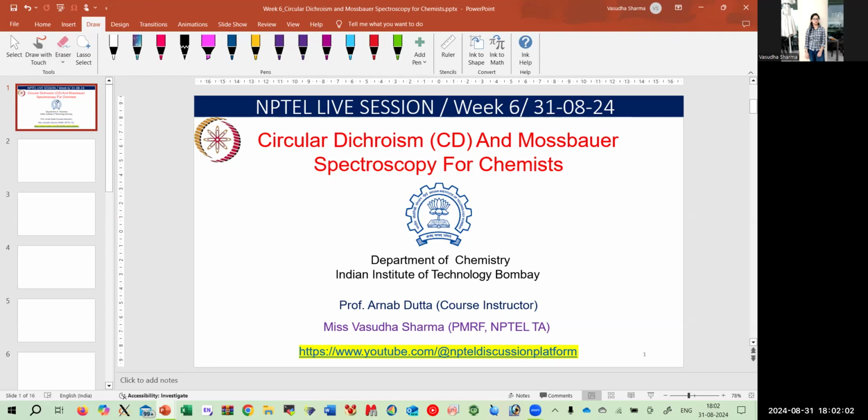And we will be discussing today about protein structures: primary, secondary, tertiary, and quaternary. Along with that, we will be talking about how the CD spectra depends upon pH and temperature, and what is the difference in alpha helix, beta sheet, and random coil structures in various examples, how CD spectroscopy helps in understanding the structures as well as identifying different secondary structures. So we will shortly start our session.